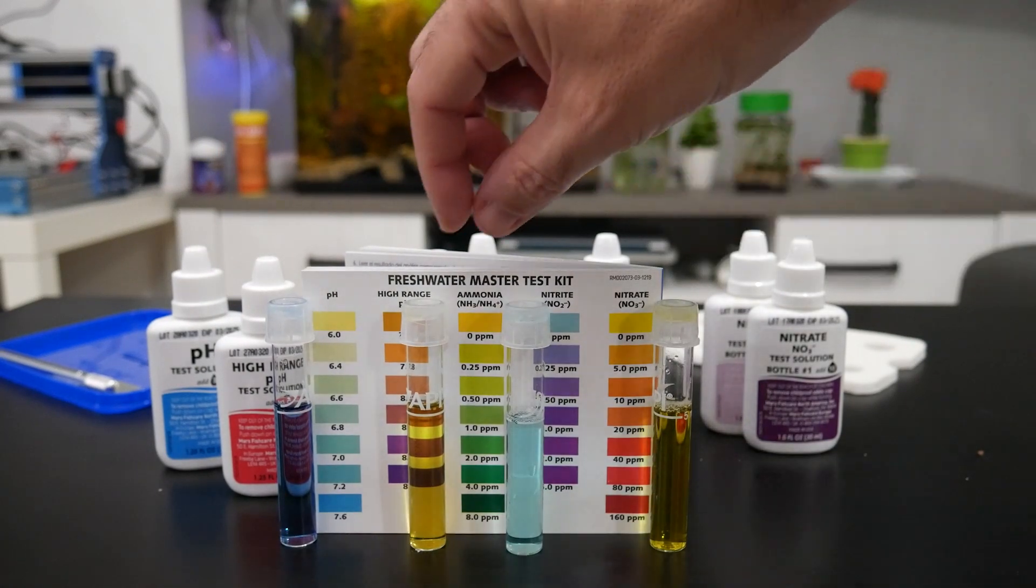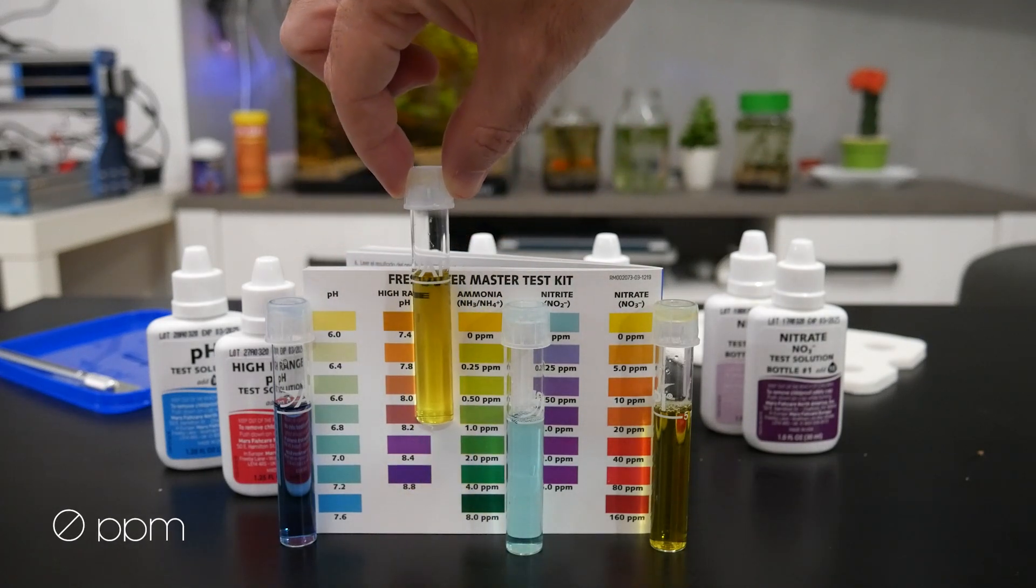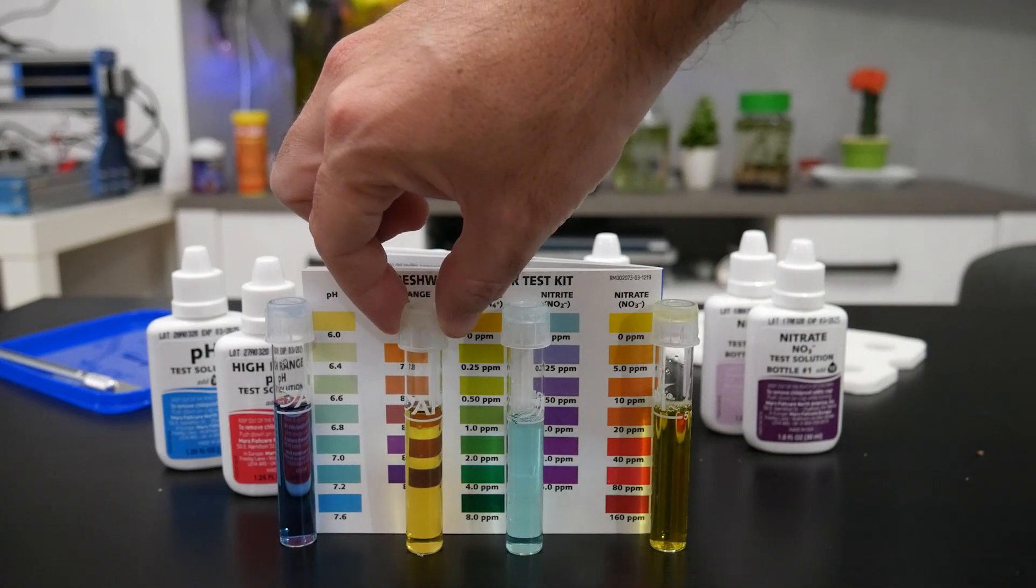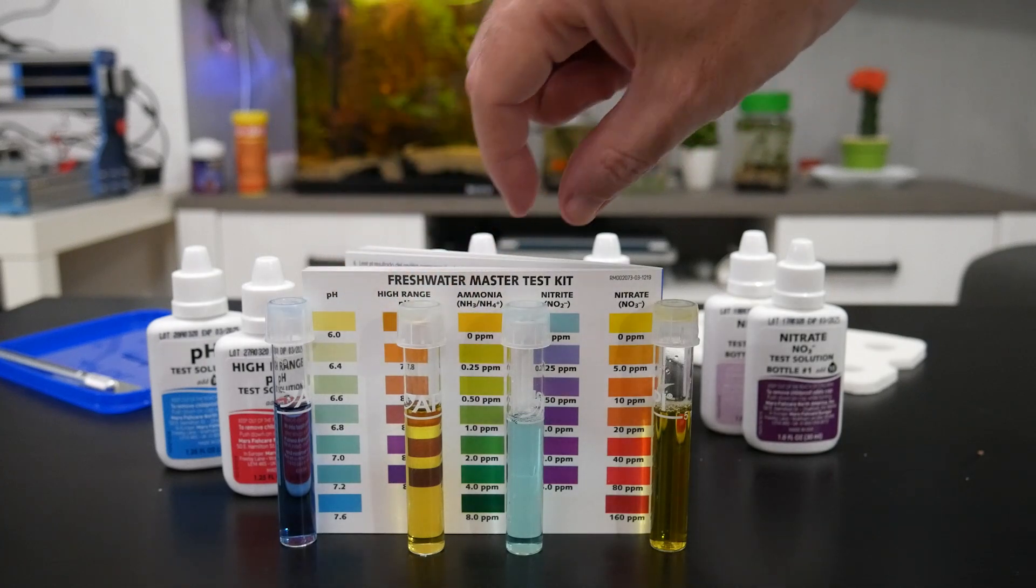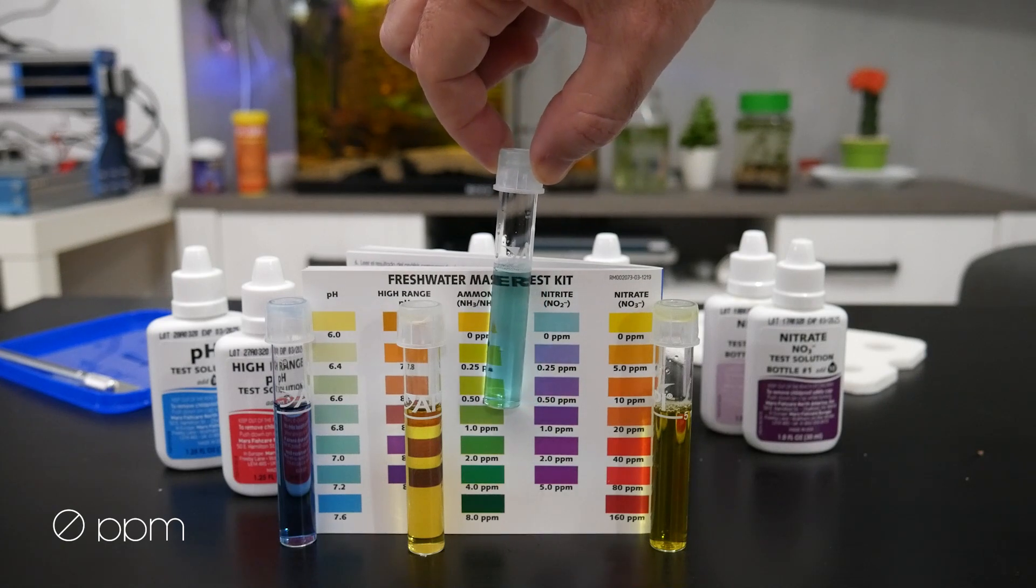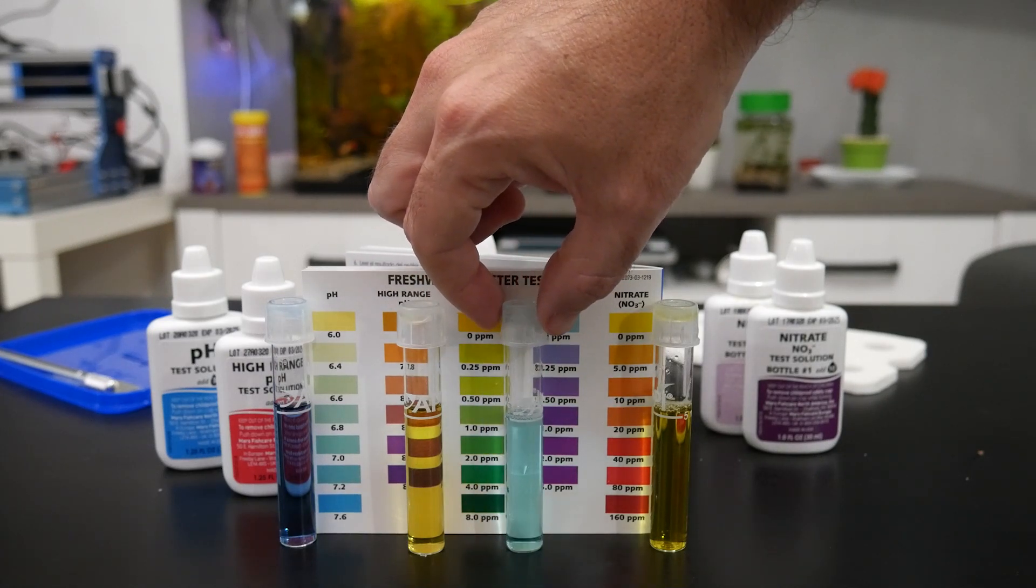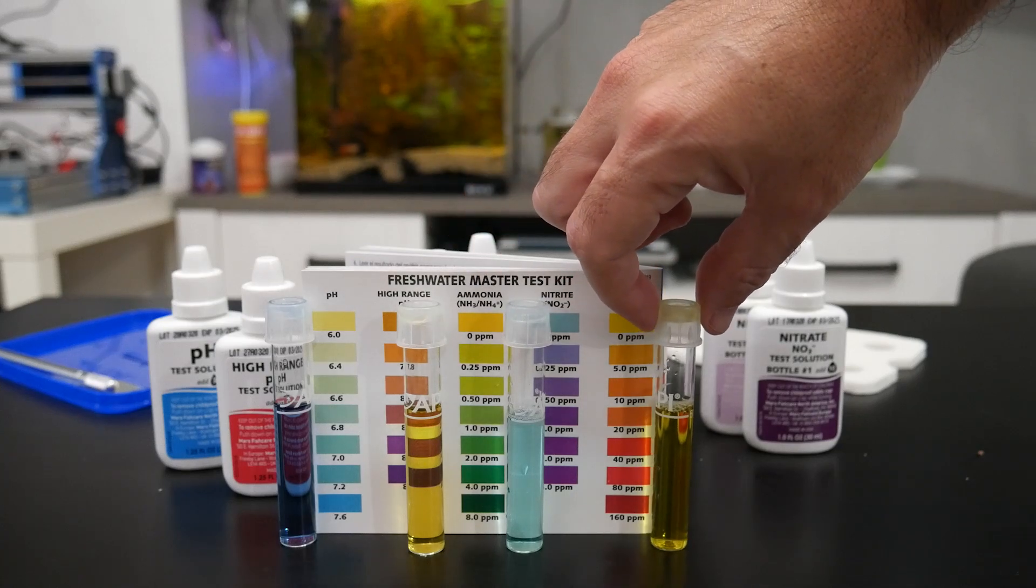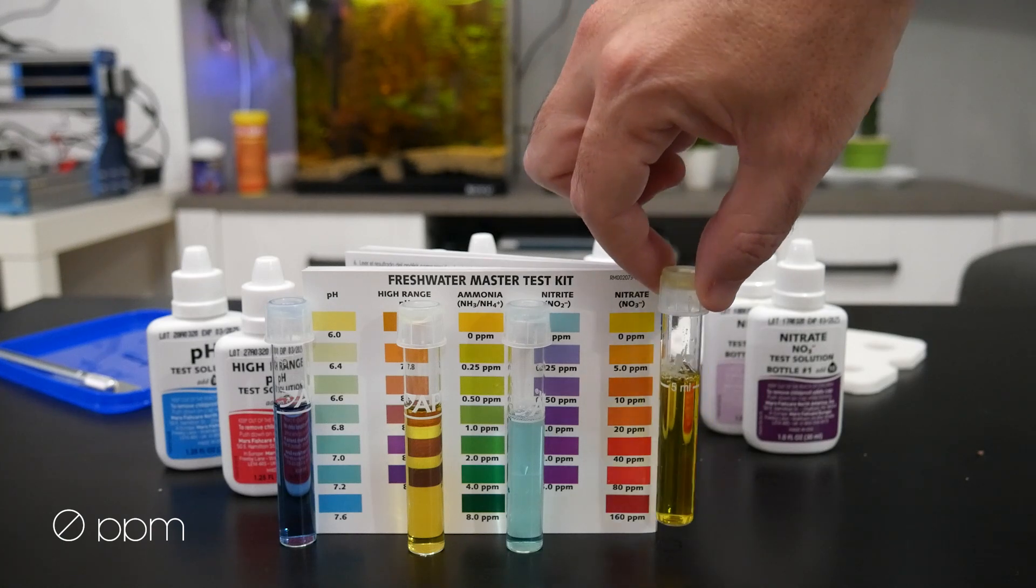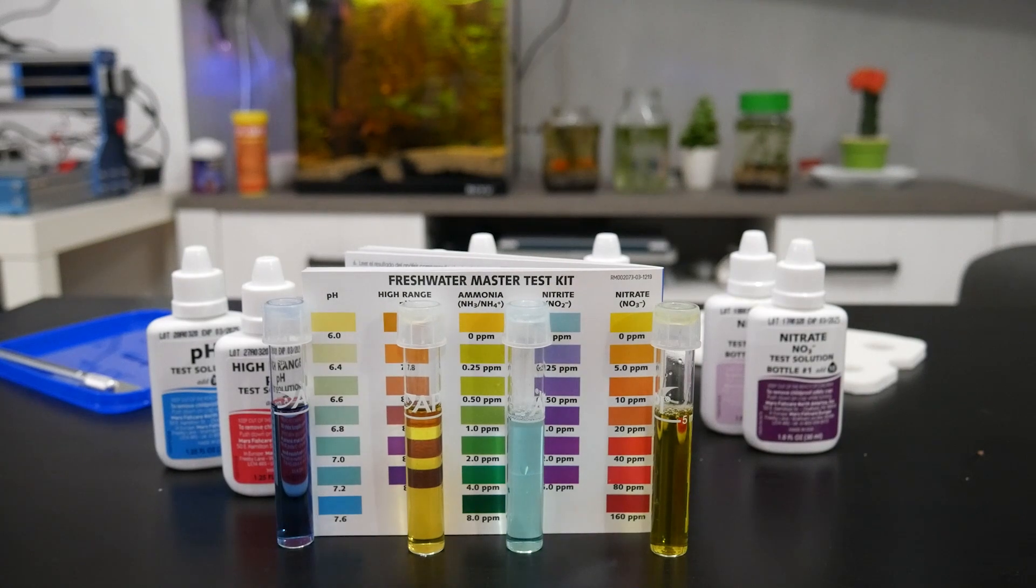The next one is ammonia. We can see that it's yellow. That is good. We don't have ammonia in the aquarium. Next one is nitrite, also zero. This is good. And the last one is nitrate, also zero. This is good. This is a quite new aquarium and we have a lot of plants, so the values are okay.